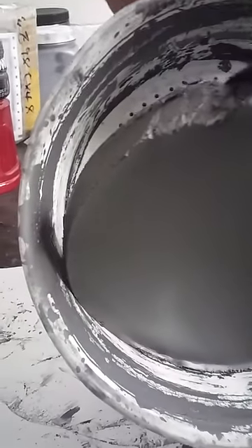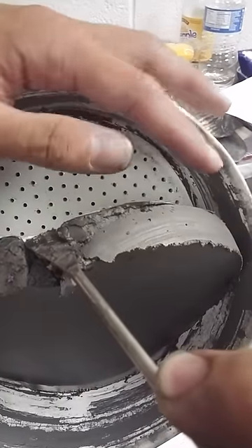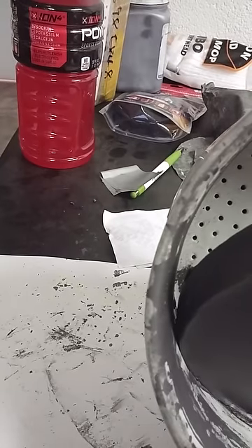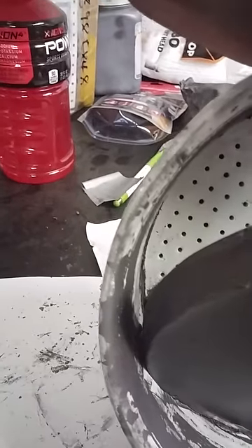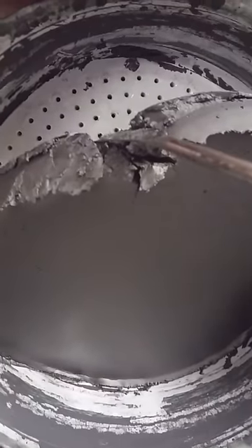Oh my god, look at that! Look at it — look compared to Eddie's hands, look how thick that is. That is a cake of graphene if you ever saw one. And look at how dirty this little work table is.